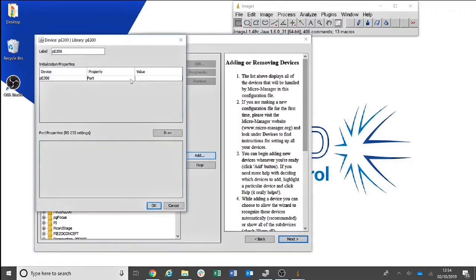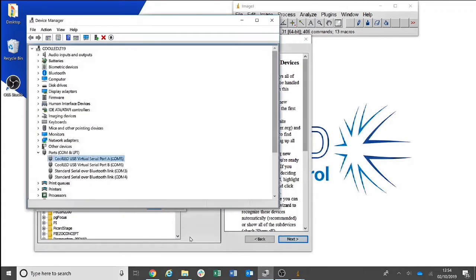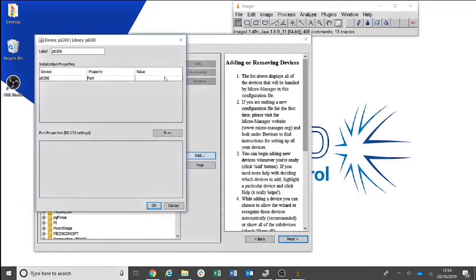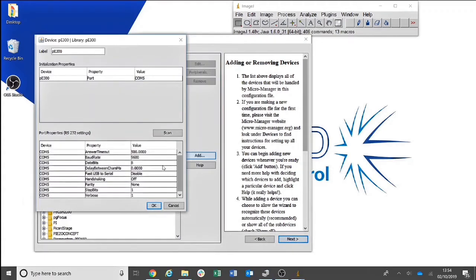You will then need to select the correct COM port under which the PE300 is connected. This can be found again in Device Manager. Here you will see port A is connected to COM5. Select COM5 and then click OK.